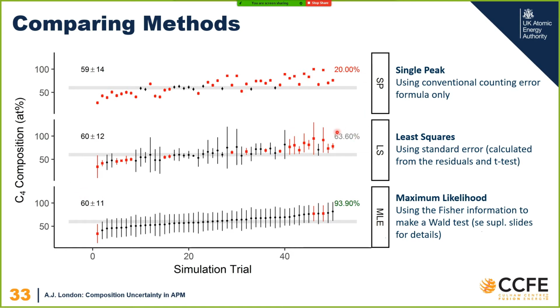With least squares, you can use the residuals to predict a confidence interval. What stands out here is that they're all over the shop. Some of them are big, some of them are tiny.